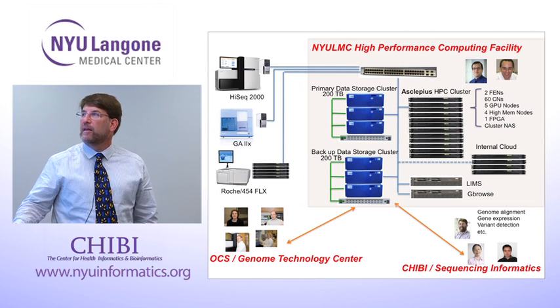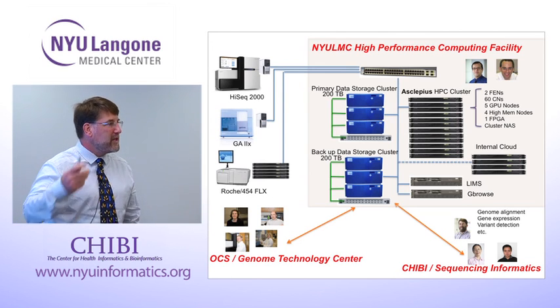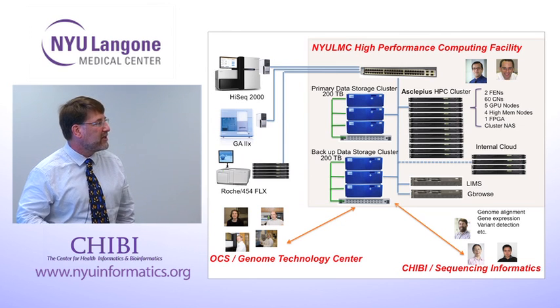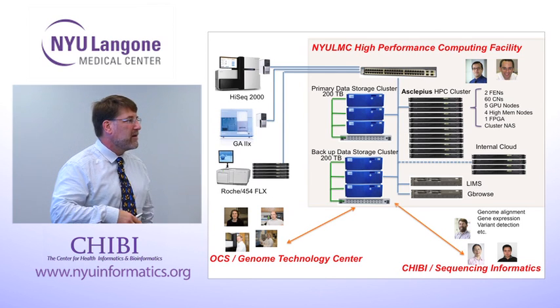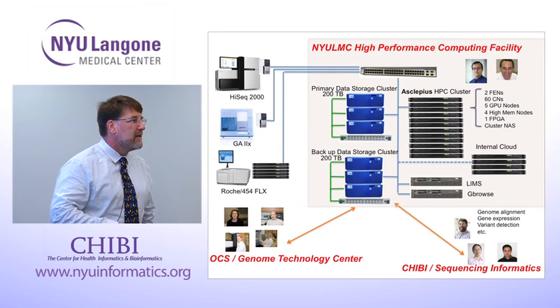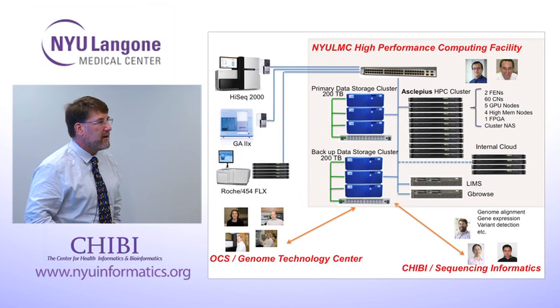Also, obviously, data storage is a big issue. And I'm not going to talk about the economics of that, but when you generate big data, you're going to have to pay for some amount of data storage over time. And it's not necessarily a good idea to download it onto a portable USB drive and store it on the shelf in your lab. Having a backed up system where all the runs are archived in some sort of organized fashion is probably going to be necessary for your research.